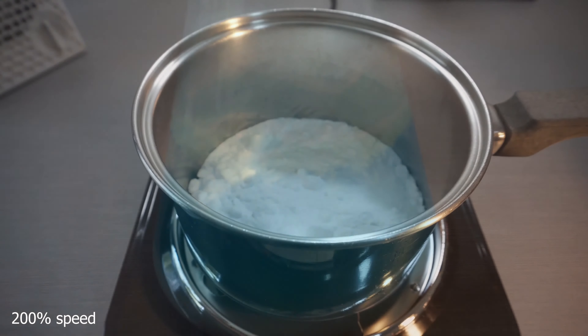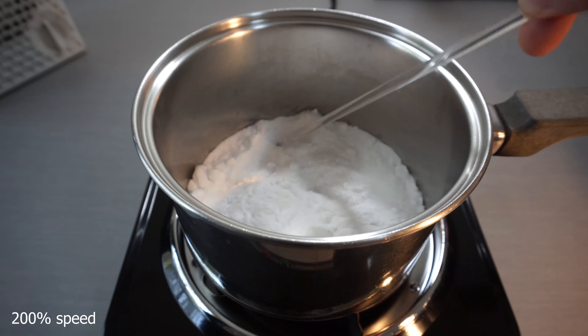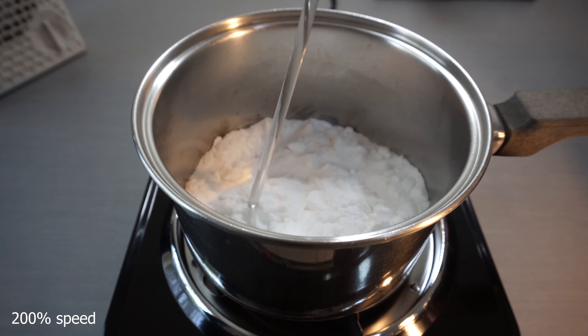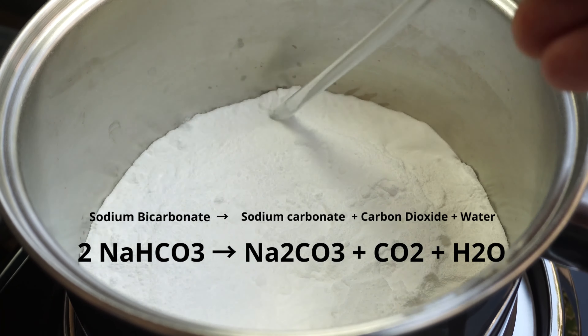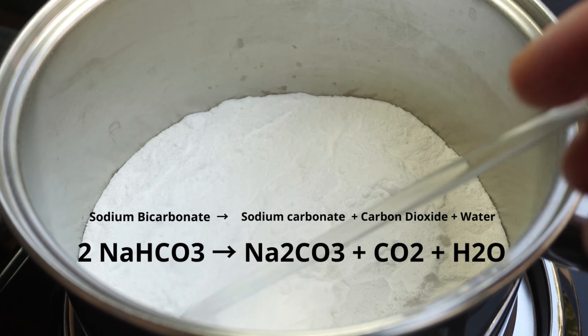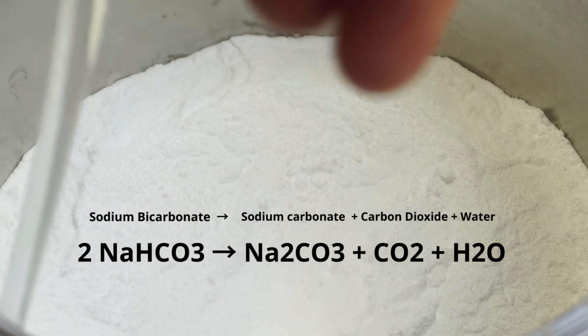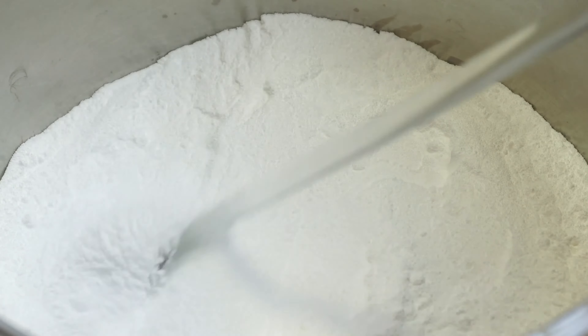We turn on our heat source at around 200 degrees Fahrenheit. We will stir the baking soda around to provide even drying. Eventually, when the baking soda is hot enough, we can see that little geysers begin to form as I run my glass rod through them. This is the baking soda releasing the carbon dioxide and water. Once heated, the baking soda turns into washing powder, carbon dioxide, and water.